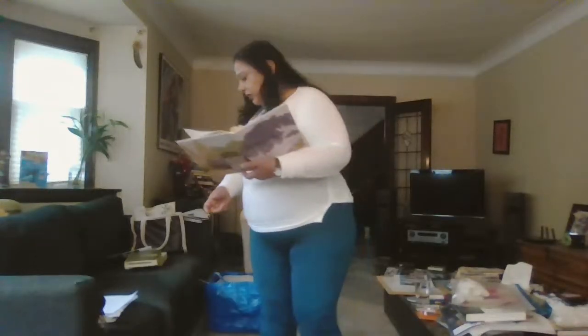So half a teaspoon, 1 teaspoon. The other factor is that I have considered only the measured mass for the plots. I showed you the plots and not the mass concentrations as for the S1, S2 parameters, which is mass by volume, a mass concentration, gram per mil.